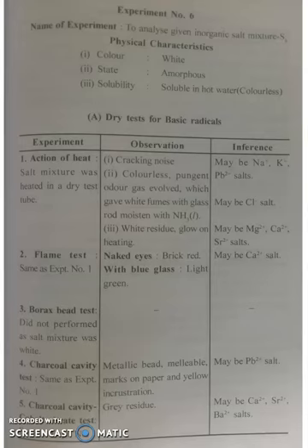So here I will discuss one practical, so that you will perform this experiment in the laboratory, and how you will write it in your practical booklet, answer booklet.